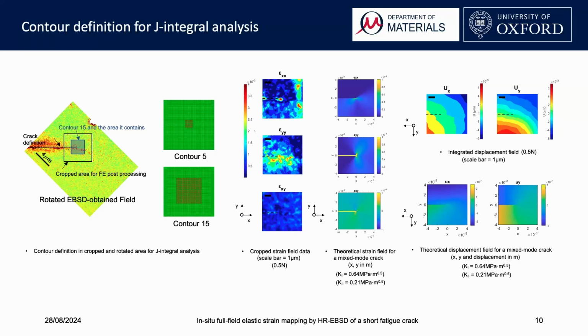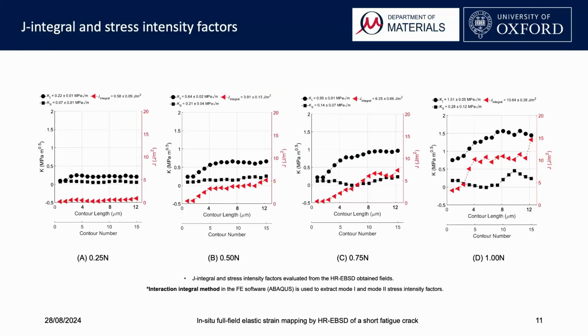On the right, the final cropped strain field data and the integrated displacement field data are displayed here. And for comparison, the theoretical strain field and displacement field were also plotted here to help us understand the connections between the strain field and displacement field.